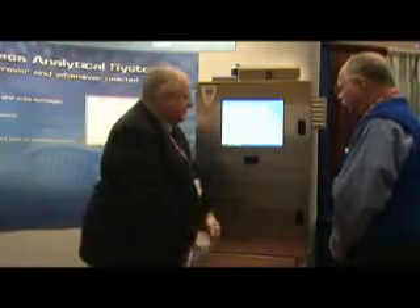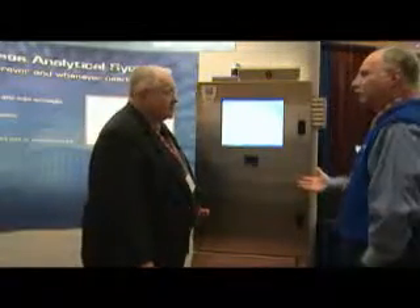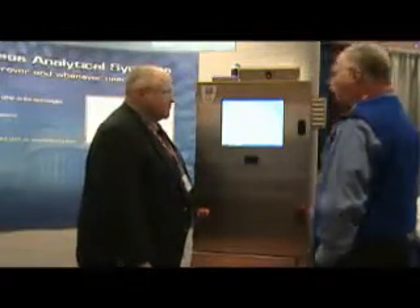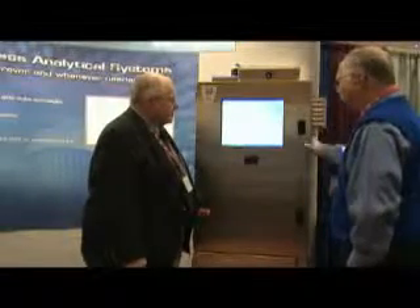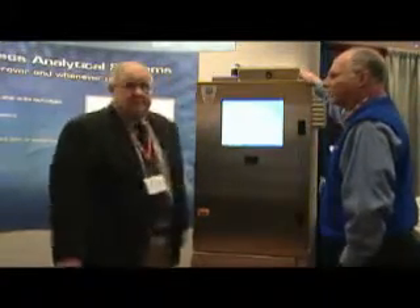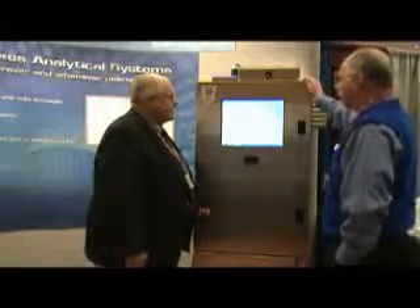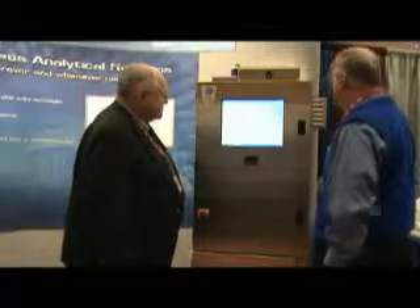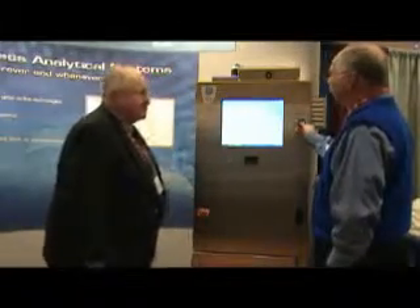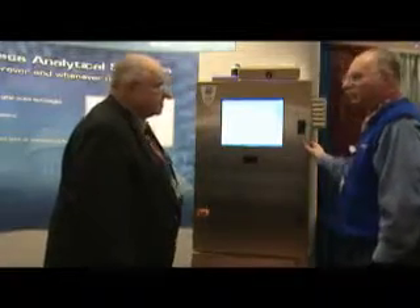This particular model is the full enclosure system, used typically in a pilot plant or manufacturing area where you need a protective environment — explosion protection for the equipment. We have an upper enclosure for instrumentation and a lower enclosure for liquids. There's a computer on the upper enclosure, a 17-inch LCD display for operator interaction, and a touch mouse so there's no open contact. We also have an optional snap-on keyboard shelf and a Bluetooth keyboard and mouse for more extensive interaction like setting up a method.